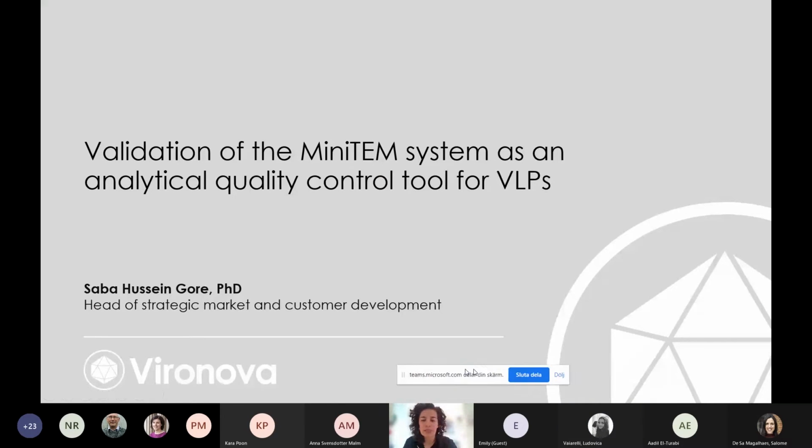So hopefully this presentation should take about 30 minutes. I'm really happy to be presenting this on behalf of our collaboration. And as Ludovica mentioned, today I'll be talking to you about the MiniTEM system and how we've used it as an analytical quality control tool for VLPs.